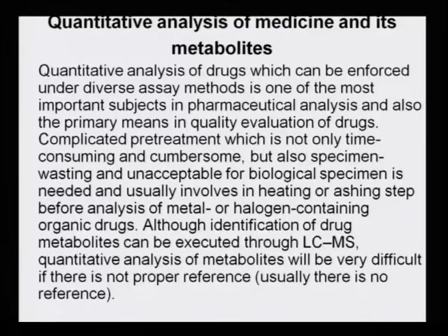Quantitative analysis of medicines and its metabolite. Just now, a while ago, I mentioned that metabolites and the main medicine can all be analyzed from the same sample. Quantitative analysis of drugs, which can be enforced under diverse assay methods, is one of the most important subjects in pharmaceutical analysis, and also the primary means in quality evaluation of drugs.